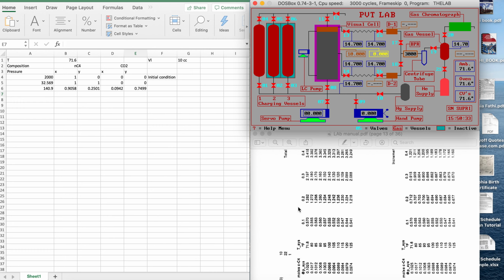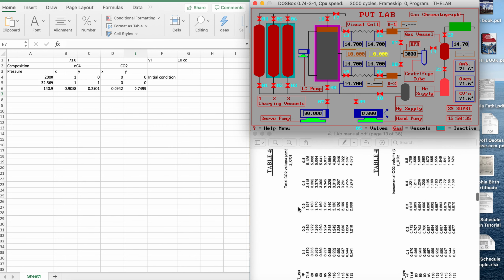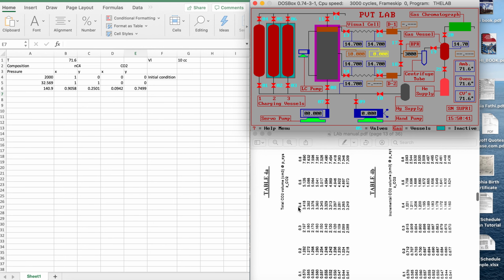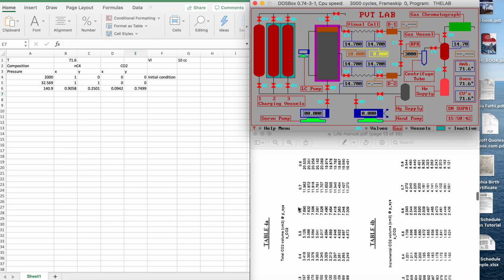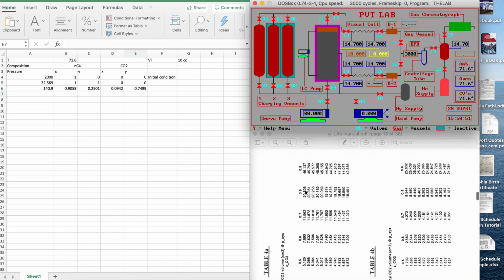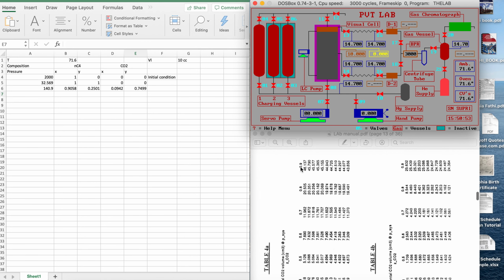Okay. So to save time, this is exactly the same every time. I just generate the mixture and I repeat this. So to save the time, I'm just going to go to the last part, and then I'll provide you with the rest of the information. Okay. So let's say I want to generate a mixture of 90% CO2. So let's say I have already done all these steps.